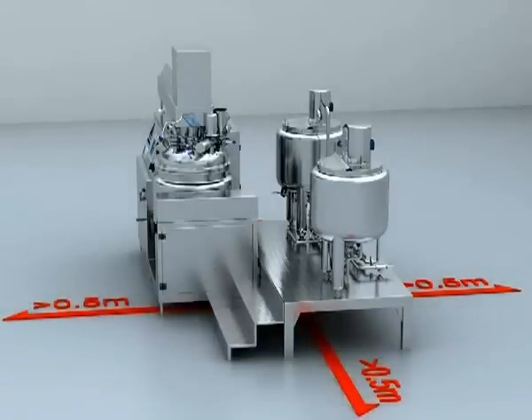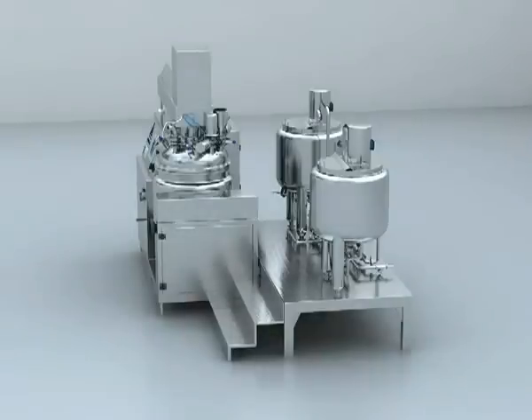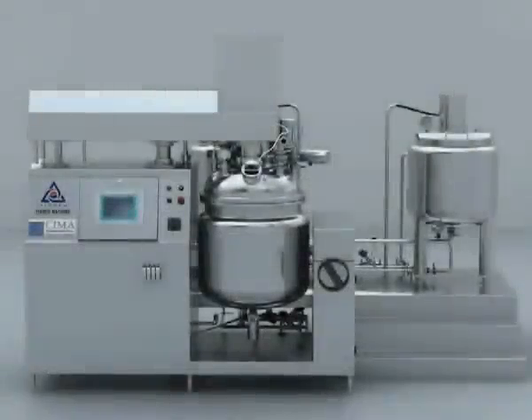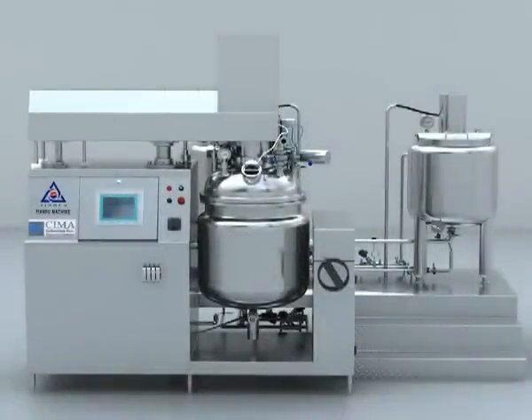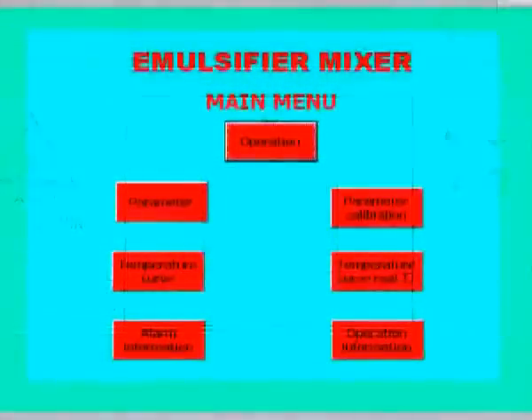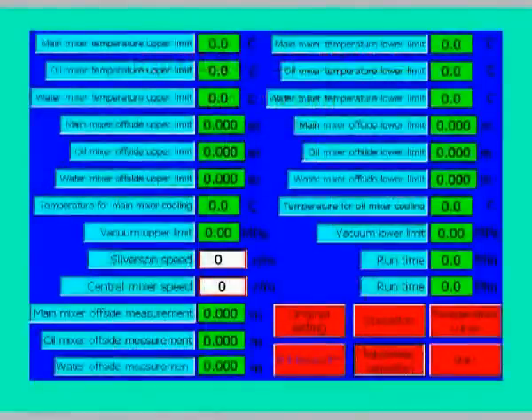The immersifier should keep a distance from the wall of at least 0.5 meter, 1.0 meter if possible, in order to do maintenance and ease the cleaning process. Operation instruction. 1. Set all parameters on the touch screen after turning it on according to the required batch process.